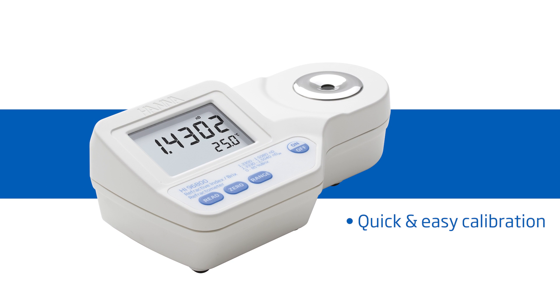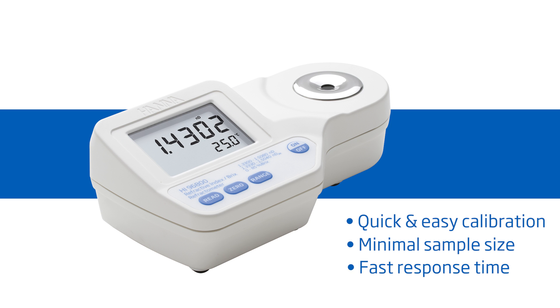It features one-button calibration, two-drop sample size, and a 1.5-second response time. HANA Instruments provides you with the necessary tools to succeed.